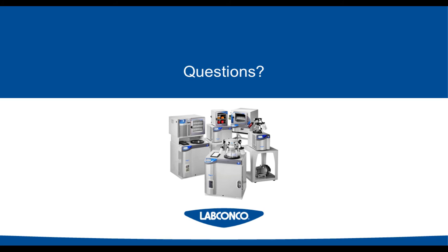Great, thank you. All right, next question. What is the suggested room temperature to run a Labconco freeze dryer? Yeah, that's a really great question as well, because sometimes we get people that call us and say they're having trouble with their freeze dryer, their samples melting, all of that kind of stuff. And a lot of times it has to do with the heat load inside of the room.